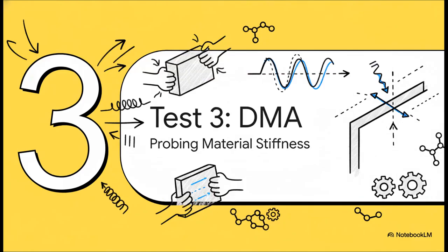And that brings us to our third and final powerhouse technique, dynamic mechanical analysis, or DMA. So DSC was energy, TGA was mass. DMA is all about the real-world mechanical response. How does it actually behave when you push on it?